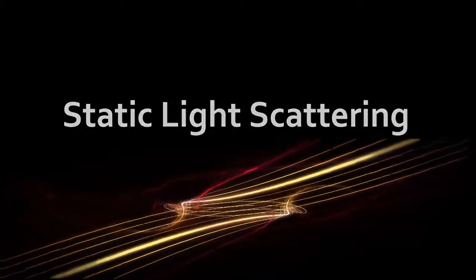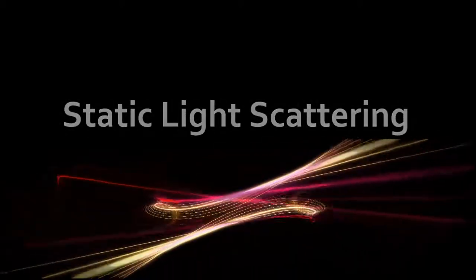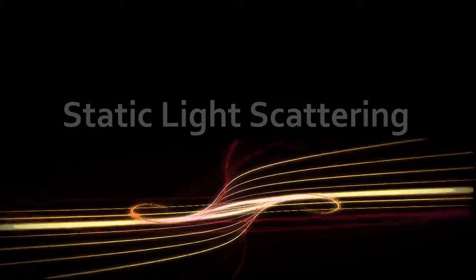Now that we've made sure our instrument is in good alignment, we can confidently make static light scattering measurements. Let's start with the SLS measurement type.